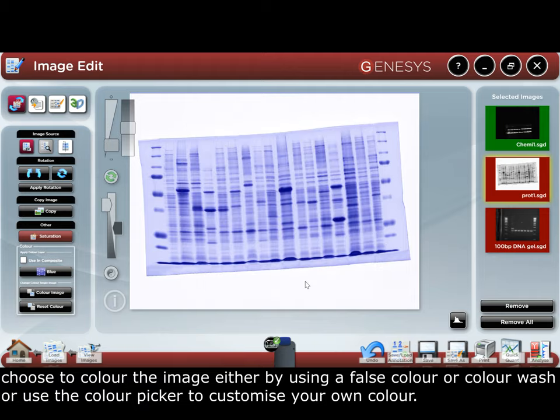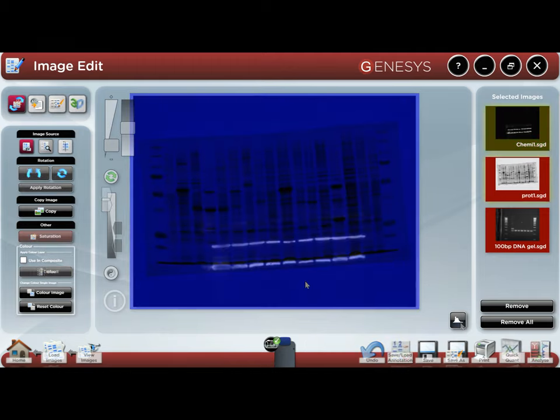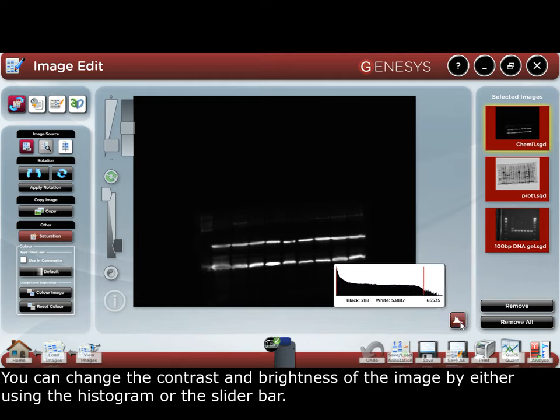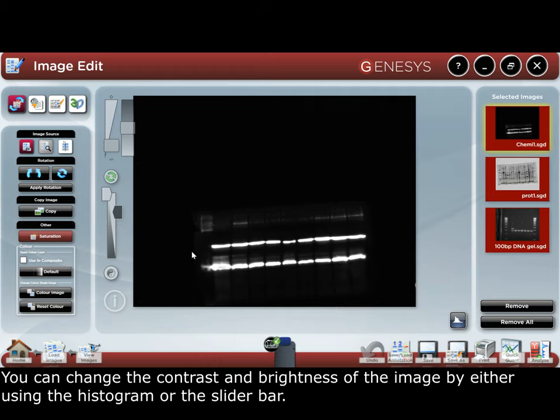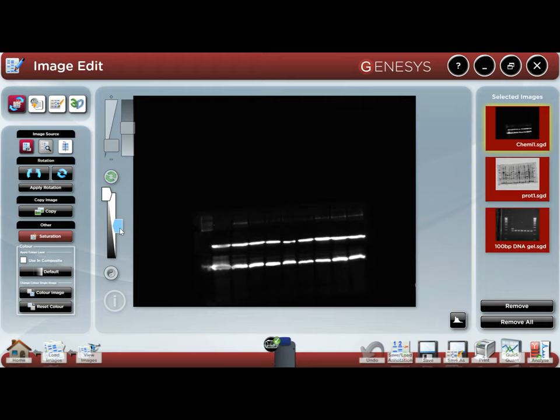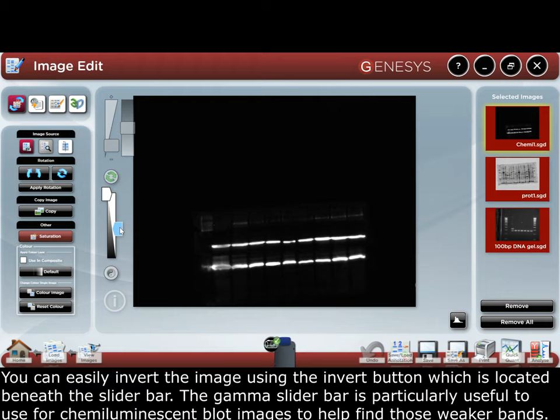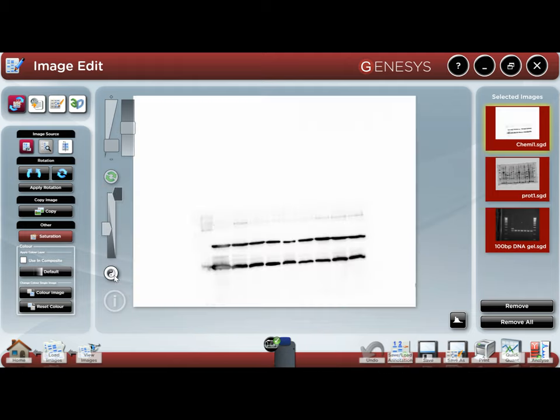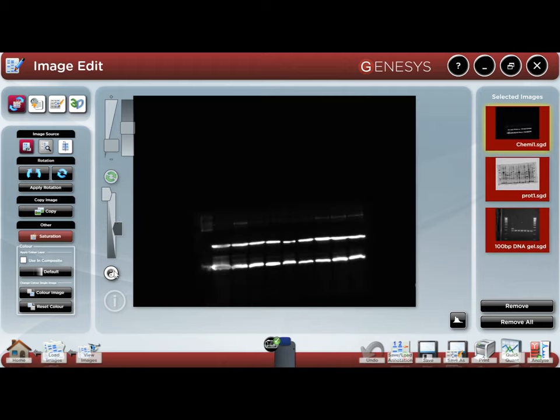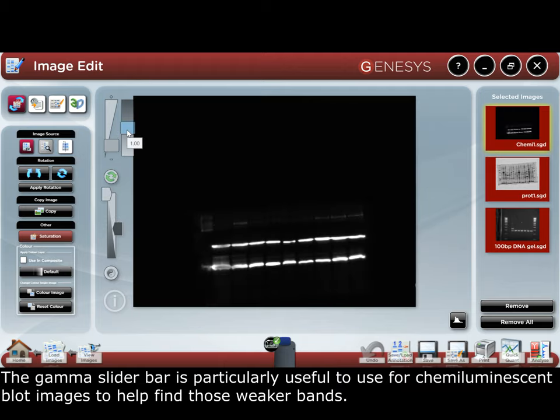Customize your own color. You can change the contrast and brightness of the image by either using the histogram or the slider bars. You can easily invert the image using the invert button, which is located beneath the slider bar. The gamma slider bar is particularly useful for chemiluminescent blot images to help find those weaker bands.